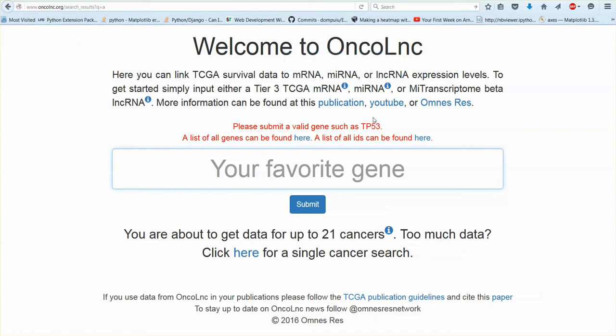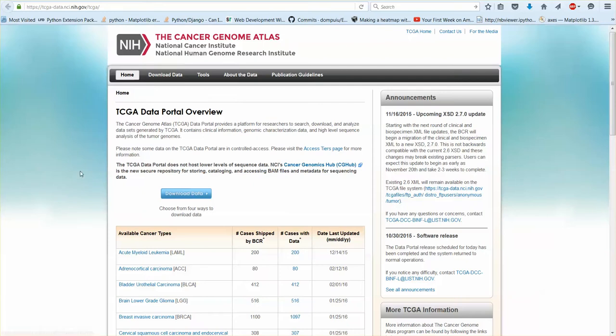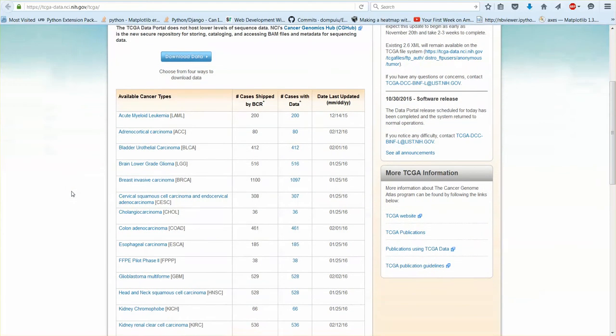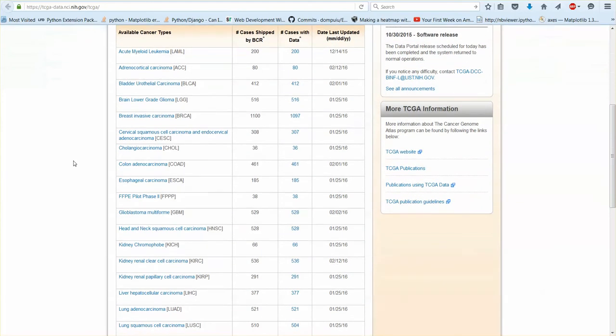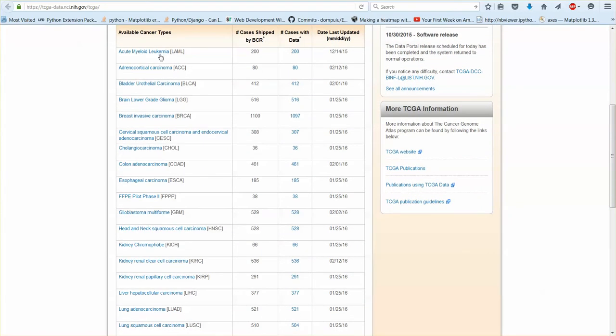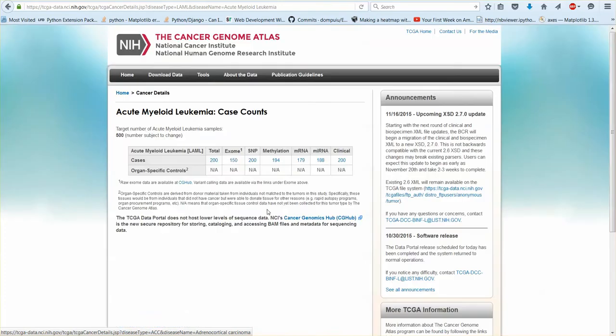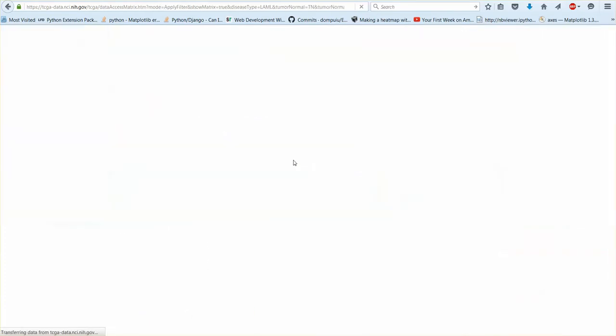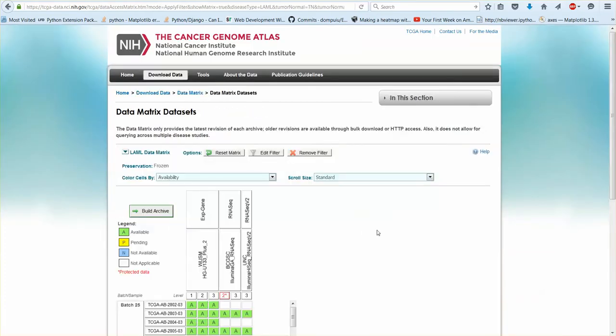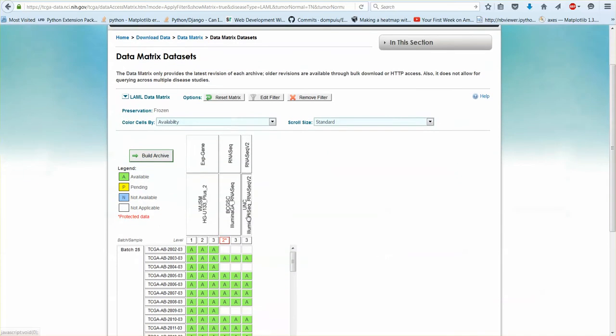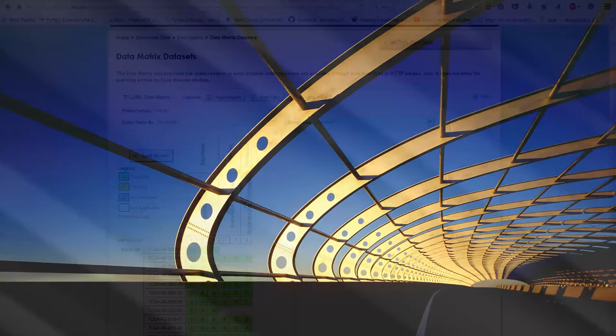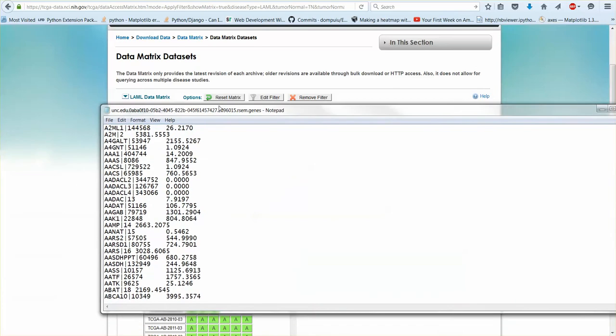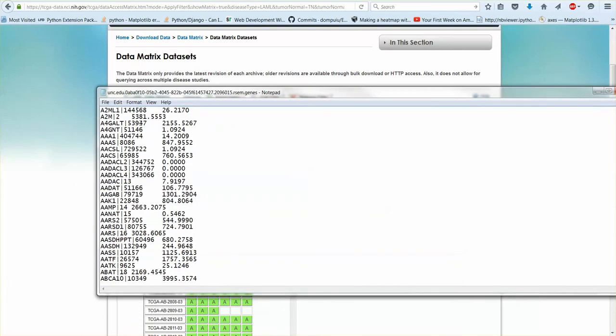When you go to the TCGA and you download the tier 3 data, you go here and you click on a cancer and you go to mRNA for example, and then you click RNA-seq V2 you download it. I have a file already downloaded and this is what you get.